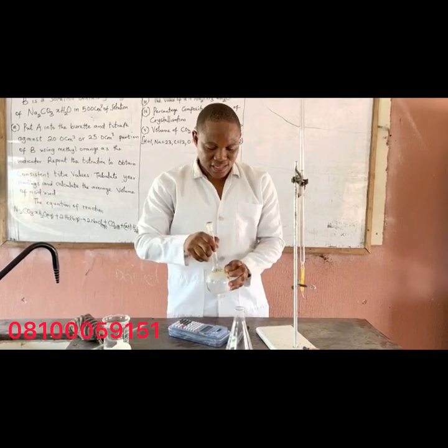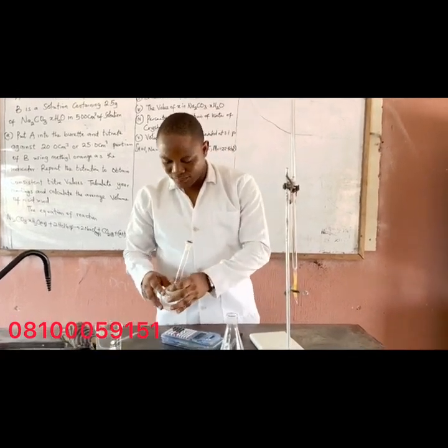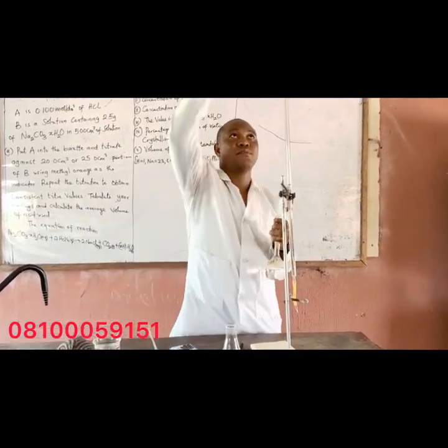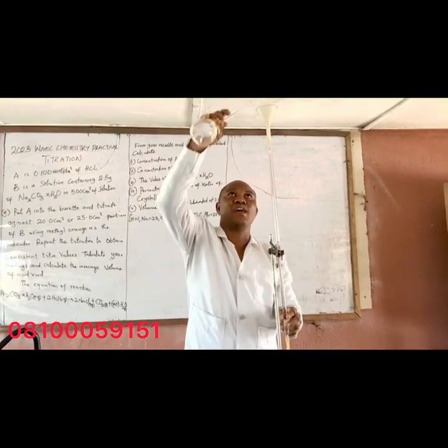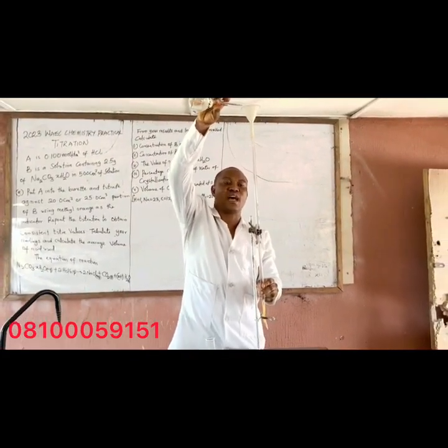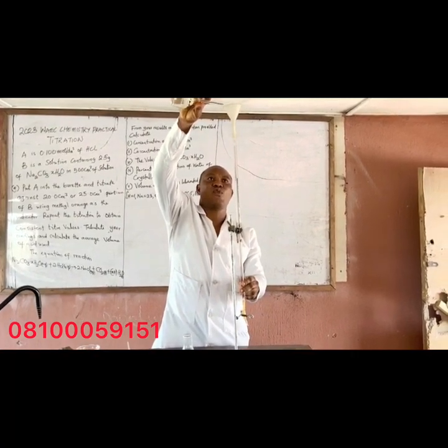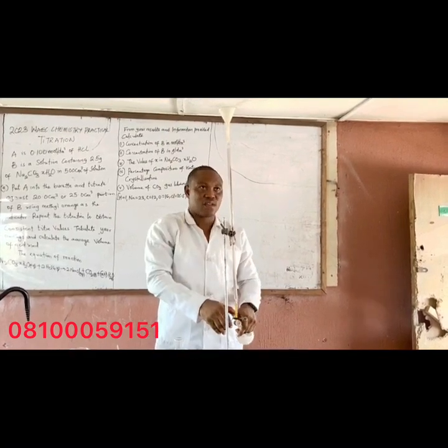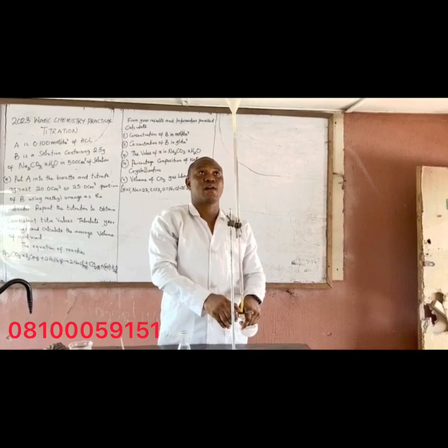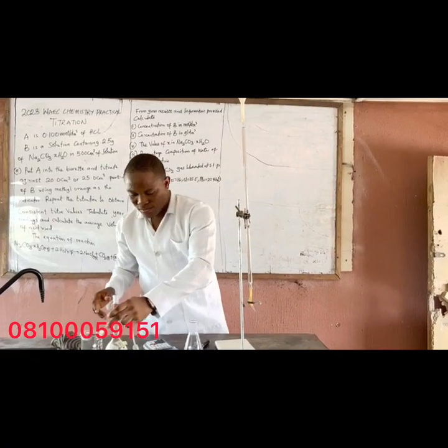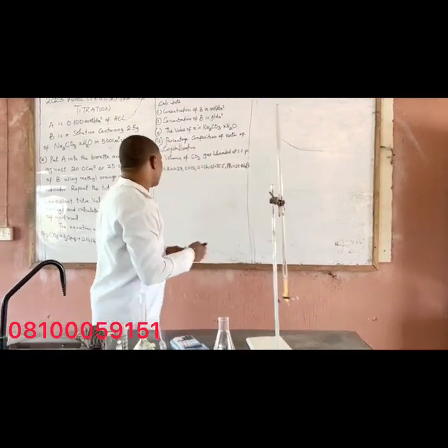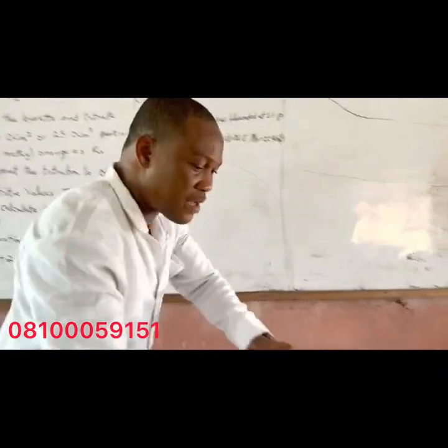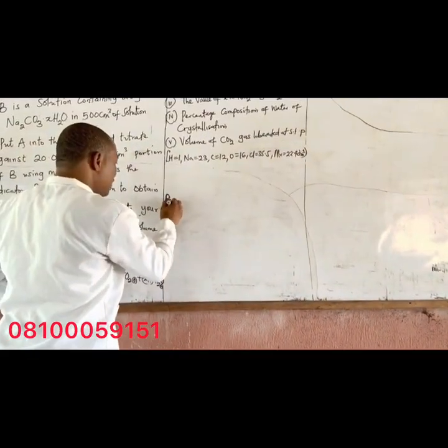Let's add the acid — this is the acid here. Add the funnel and let's fill our burette with acid. We are going to be doing it practically like we normally do. This will enable confidence. That's too much — let's bring it to the zero mark. Perfect. Before I start, let me take my burette readings.